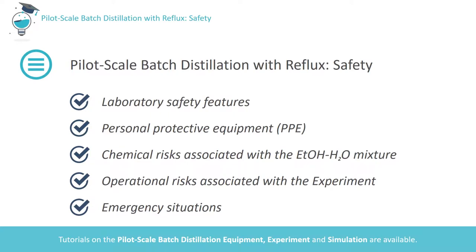Hello and welcome to this safety tutorial for operation of the pilot-scale batch distillation column in the UCD School of Chemical and Bioprocess Engineering. We'll identify the laboratory safety features and PPE required to conduct the experiment, identify the chemical risks involved, and consider action required in case of emergency. Please note that there are associated video tutorials on the distillation apparatus and on the experiment itself. Before watching this safety tutorial, you should have watched the distillation equipment tutorial.